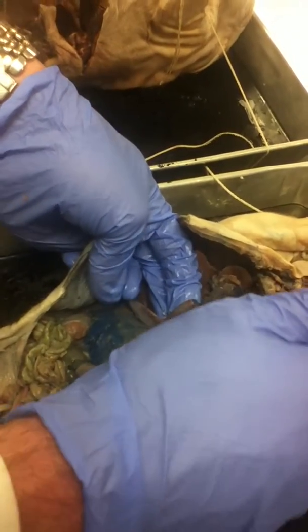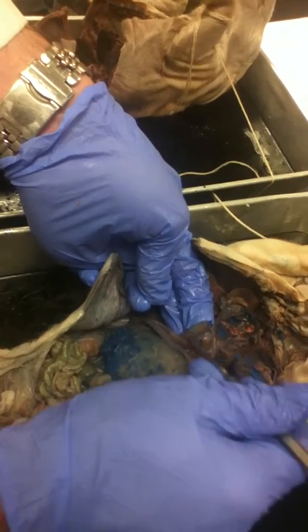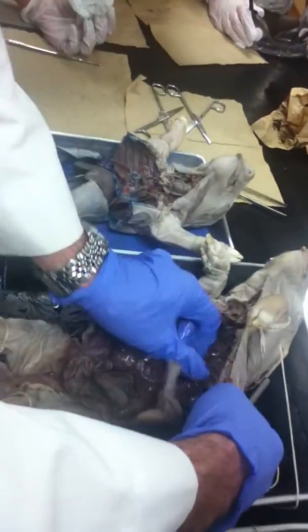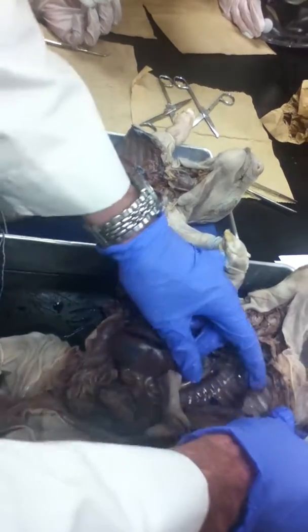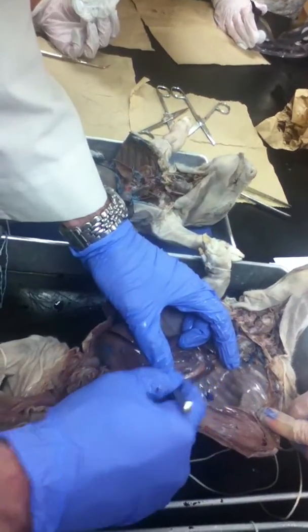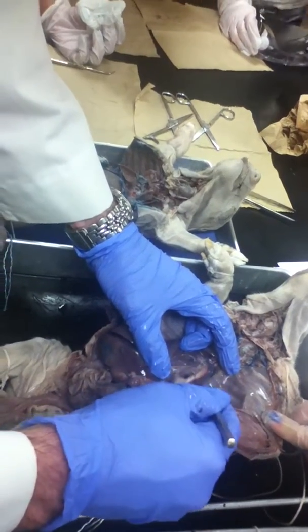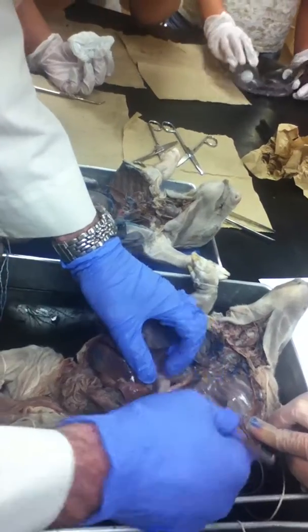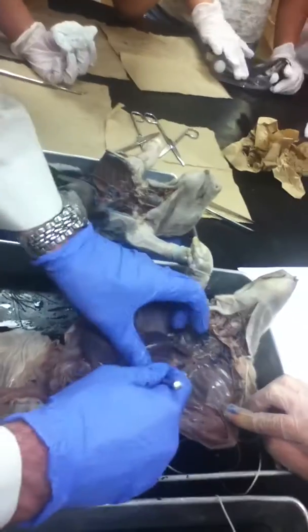This here, which is cut, that is your inferior vena cava, which connected to the heart, okay, which drains the blood flow from the bottom portions of the body. On the back here, this one here. On the back, hold that down there, Olivia. Good. This white thing here, that's the dorsal aorta, okay? So that's your dorsal aorta, that big white structure there, all right?